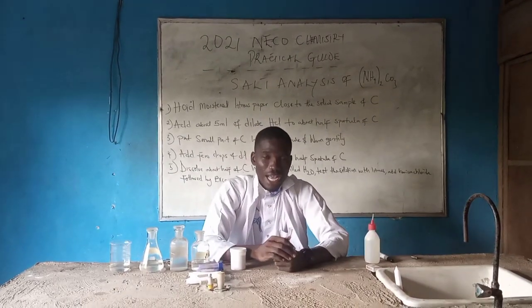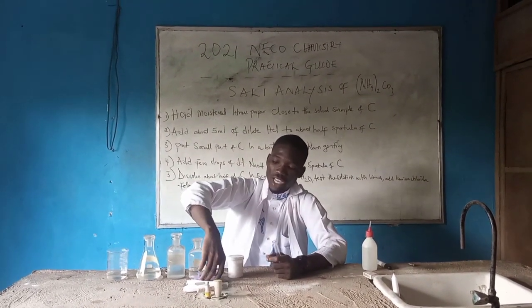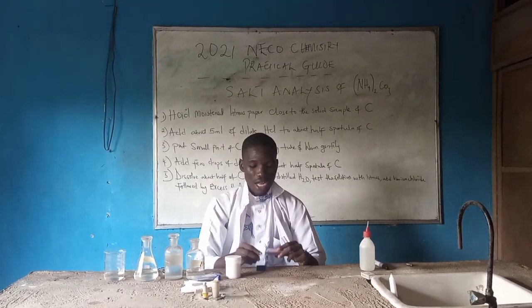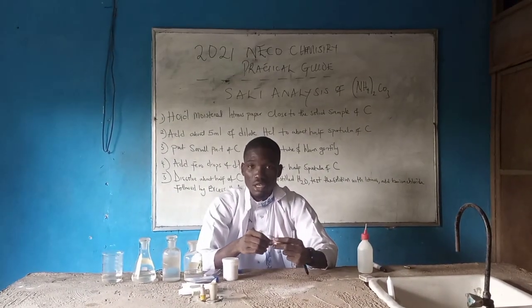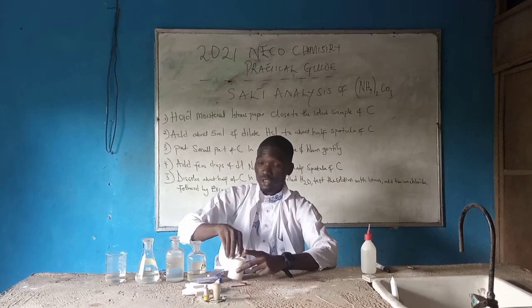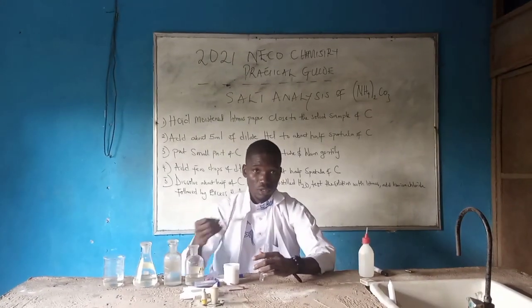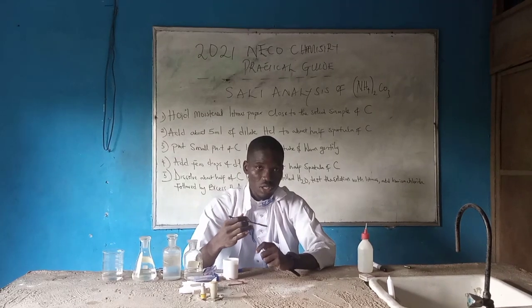Here is my test tube. To carry out the first practical, you have to bring out your red litmus paper and moisten it — you have to wet the litmus paper. Then after that, you can use this spatula. Just pick half a spatula of the sample and pour it into the test tube.